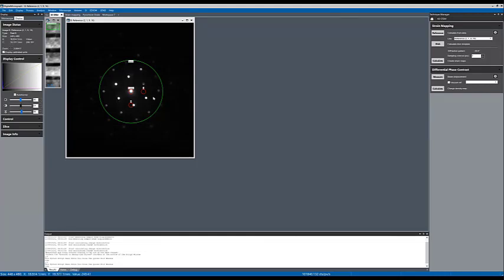In this reference diffraction pattern, you can define the directions for which you want to calculate the strain. Those would be this U and V vectors. You also identify the central spot. From the center spot selection, it is going to generate a template that it is going to use to find all the other diffraction patterns in your data set, or the reflections.